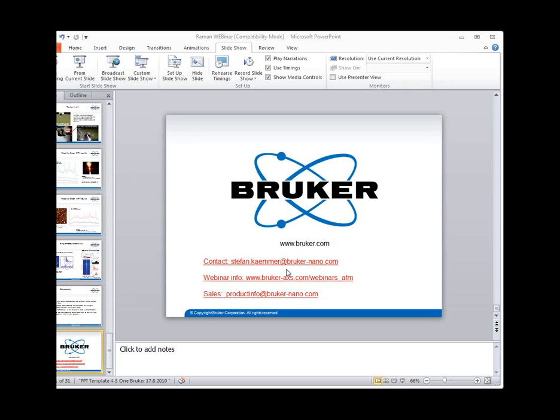So, is TERS possible with icon? I think we went through that. If you would modify an icon by placing an XY or XYZ stage underneath, so to scan the sample, then you might be able to rig something up. But again, it should be possible, but it's nothing that we at this point promote or sell.